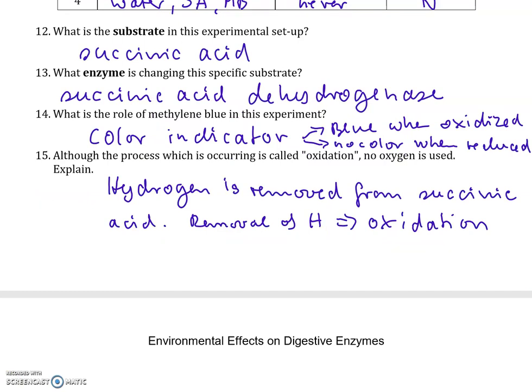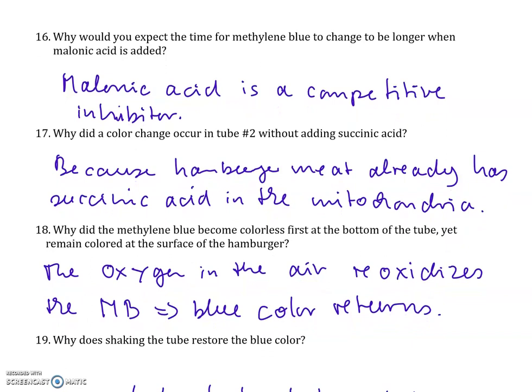The substrate in this experiment is succinic acid, and the enzyme is succinic acid dehydrogenase. Methylene blue acts as a color indicator: it is blue in its oxidized state (when exposed to oxygen) and colorless when it is reduced (when hydrogens are added). The process occurring is called oxidation — defined here as the removal of hydrogen — and hydrogen is removed from the succinic acid. Malonic acid is a competitive inhibitor, so it takes longer for methylene blue to change color. Test tube 2 changed color without added succinic acid because succinic acid is already present in the hamburger meat.